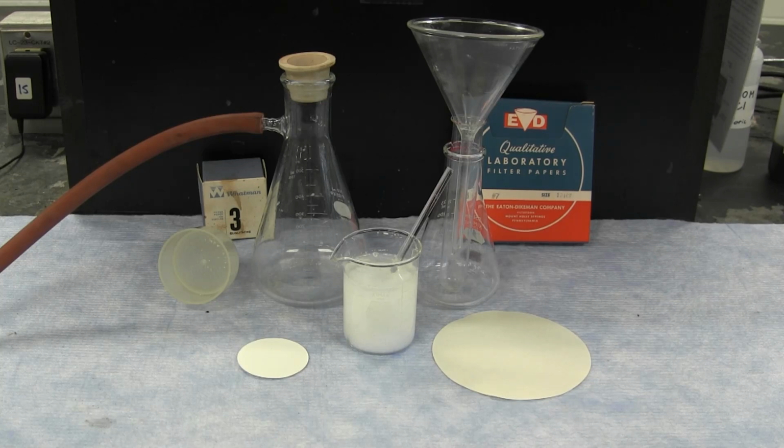In a lab setting, one of the very important techniques when dealing with precipitation or recrystallization reactions is how to filter off the solid and the liquid. And many times this is done through the use of filter paper, very similar to coffee filters at home. There are two basic types of filtration using filter paper: gravity filtration and vacuum filtration.